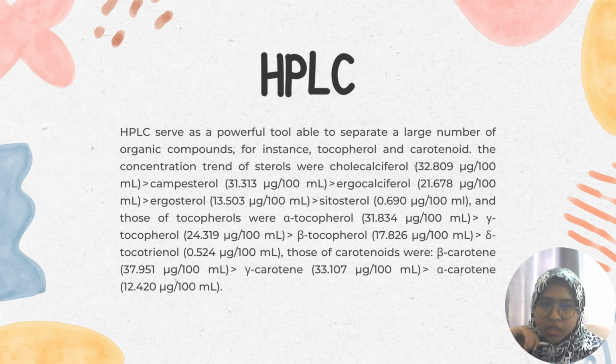Next, HPLC. HPLC stands for High Performance Liquid Chromatography. HPLC serves as a powerful tool able to separate a large number of organic compounds, for instance, tocopherol and carotenoid.